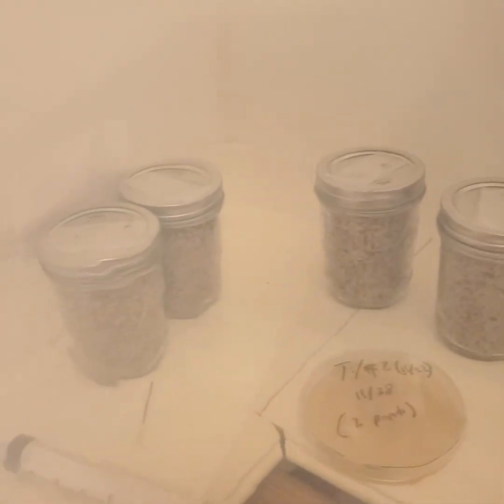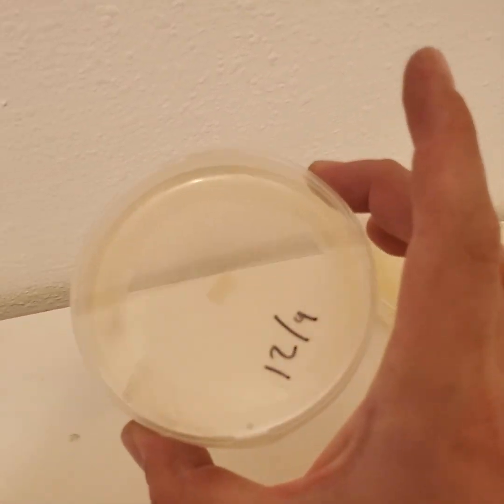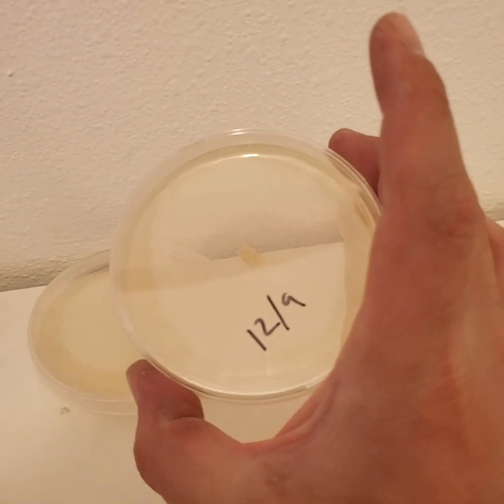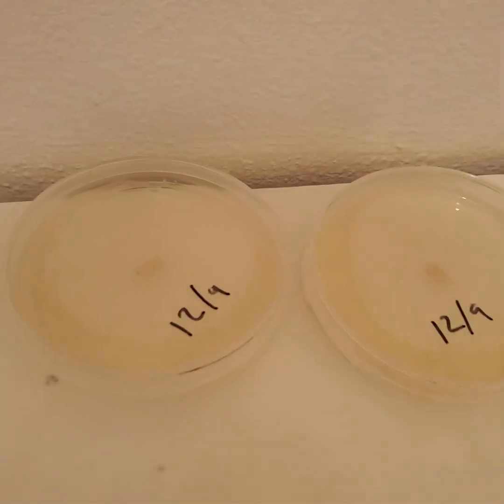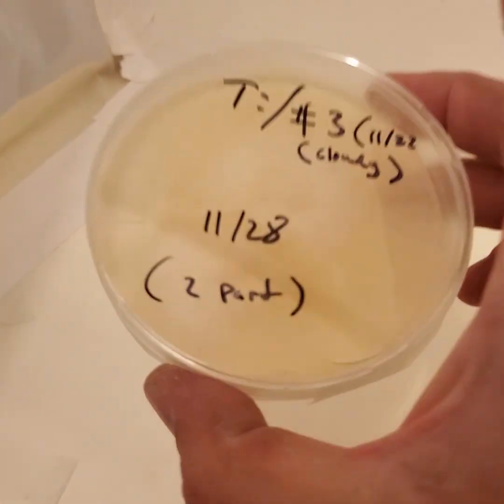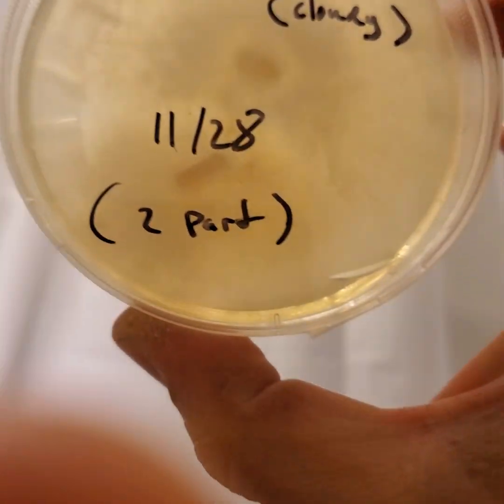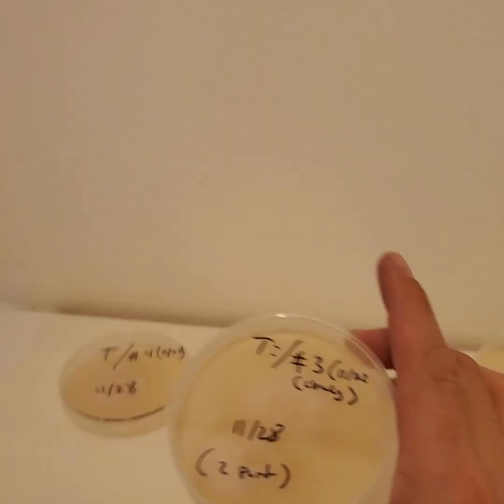I've basically been learning everything by watching YouTube while experimenting. I made some separate cultures — that favorite plate is why I transferred out of it, the mycelium growth looked the neatest. I took a transfer from it to preserve it. This other dish is much cloudier and the mycelial patterns don't look as good, though they're still pretty decent.